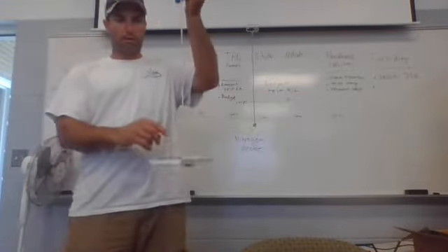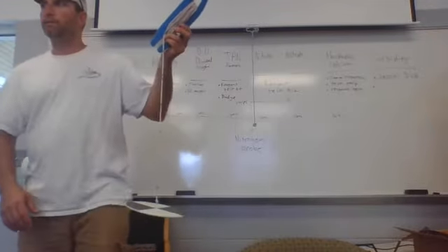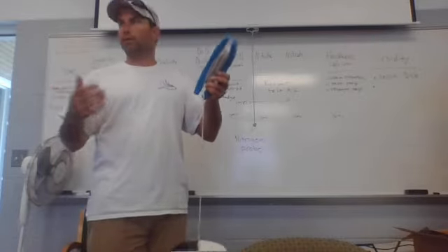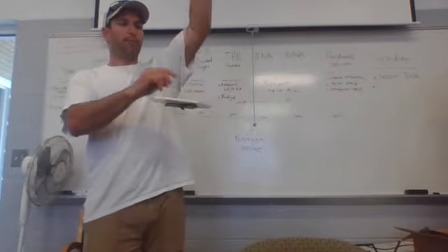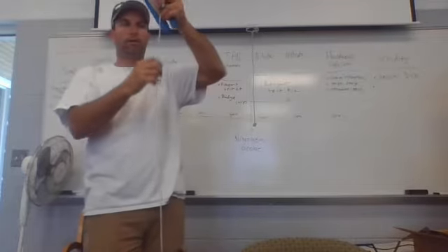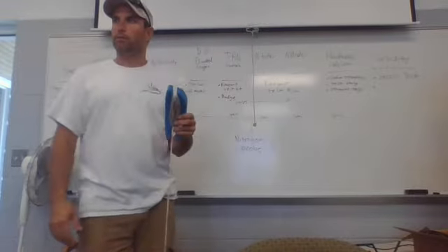Like 30 feet then, or 30 something. I saw a video where they did that. Yeah, in the murky water, this is something they usually carry with you if you're out doing any kind of biological sampling or water sampling. This is graduated. The line has marks every 1/10 of a meter, and it's red at the 1 meter mark, so you can get your actual Secchi depth.